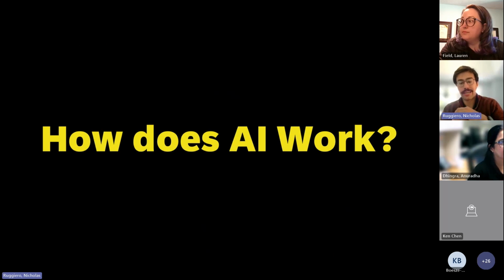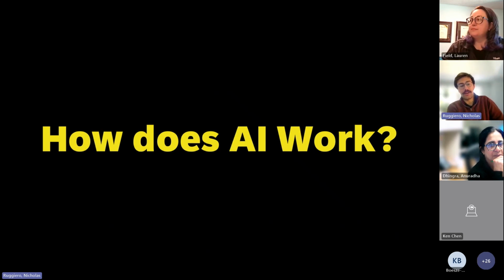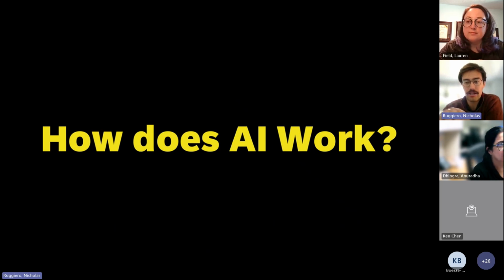Next, you might be wondering, how does the AI actually do what it's doing? We're going to touch on that a little bit. You could probably fill an entire graduate degree with what AI is actually doing, so we're just going to give a short intro in the context of what the AIs are doing for our AI tools specifically.